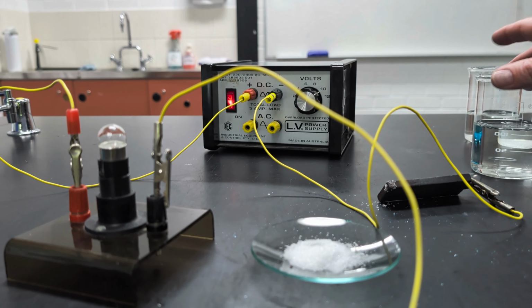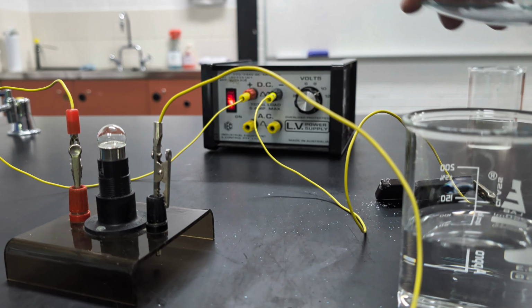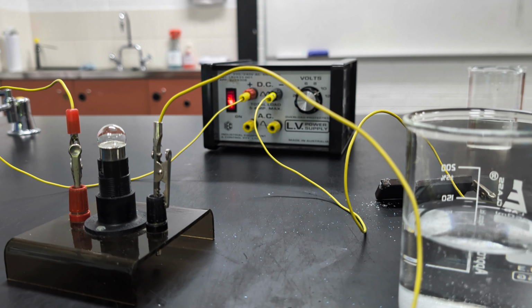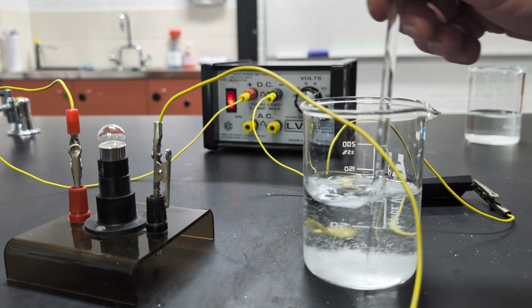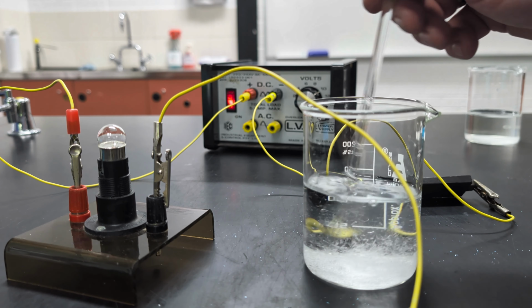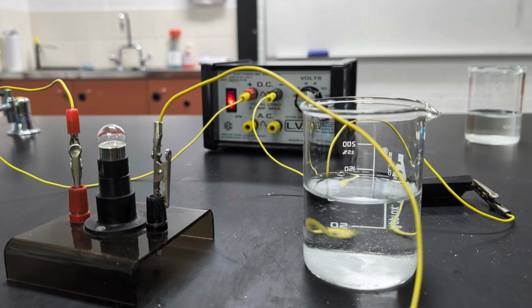Well, that's okay. We know what to do, don't we? We can pour our sugar into some water. Give it a bit of a stir around. Now, like the salt, not all of the sugar has dissolved. We know sugar does dissolve in water quite readily, but that's okay. We just need a little bit dissolved for now. And place your bets. What do you think will happen?